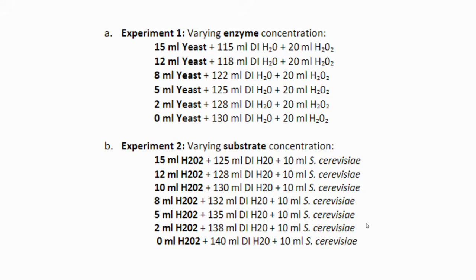So, just a little bit of a refresher for you. We're doing two different experiments, one of which is we are changing the enzyme concentration. Just a reminder that the yeast has the catalase in it. So, you can see that the yeast amount is changing, everything else stays the same.